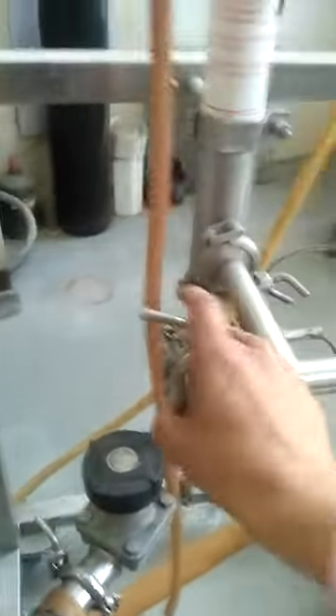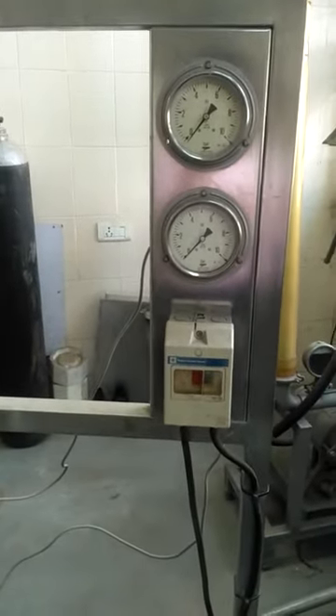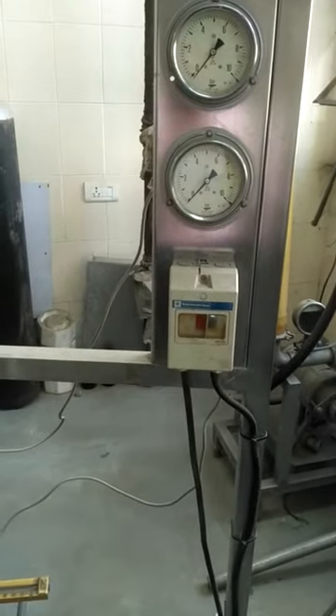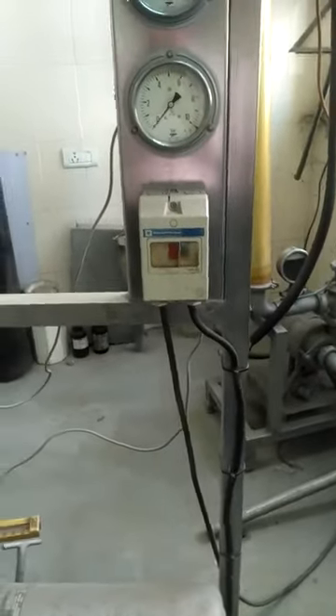So both of them will be coming out as a single stream from the top end here. This is the outlet or discharge of the permeate, connected at the top to maintain a positive pressure at the permeate side. Here we can see the pressure gauges for the inlet and outlet, and the on/off switch for this pump.